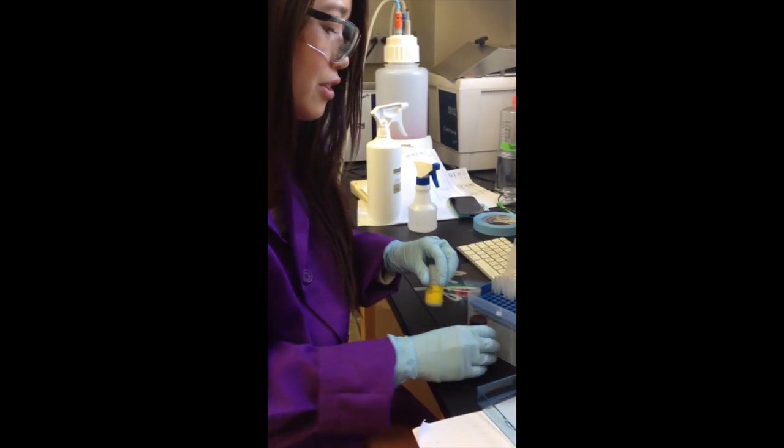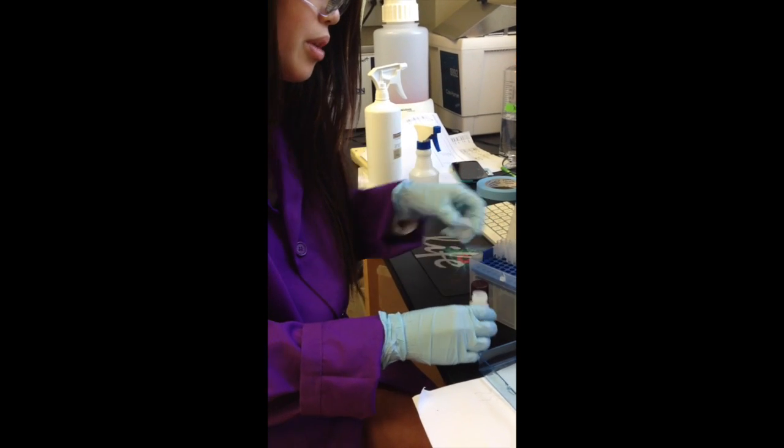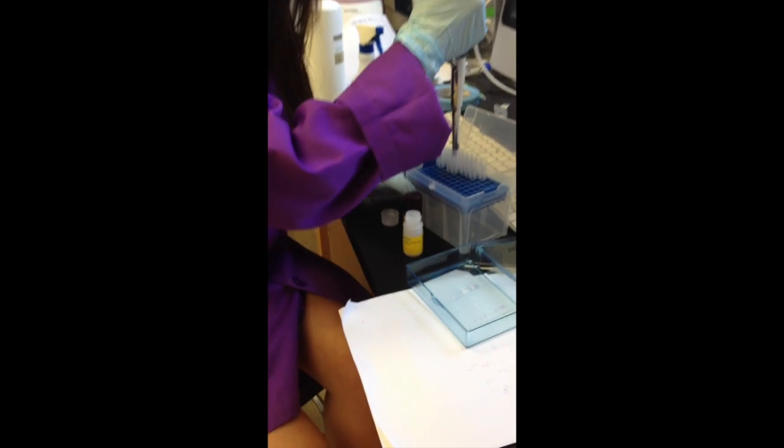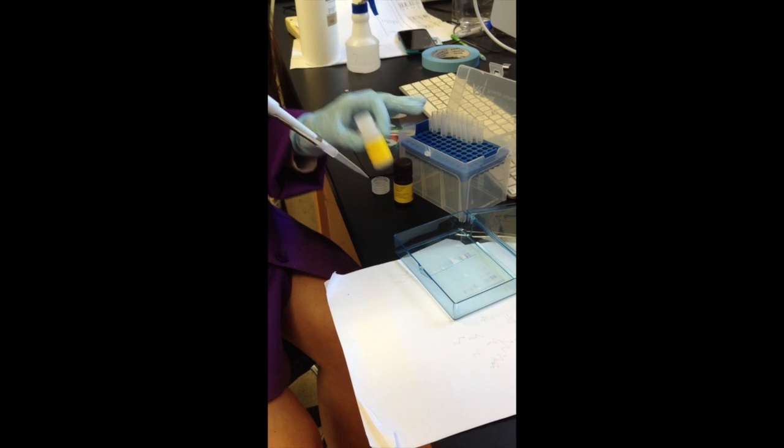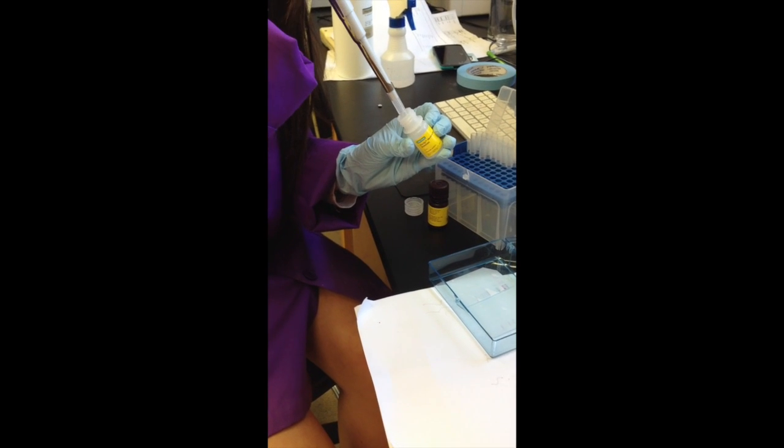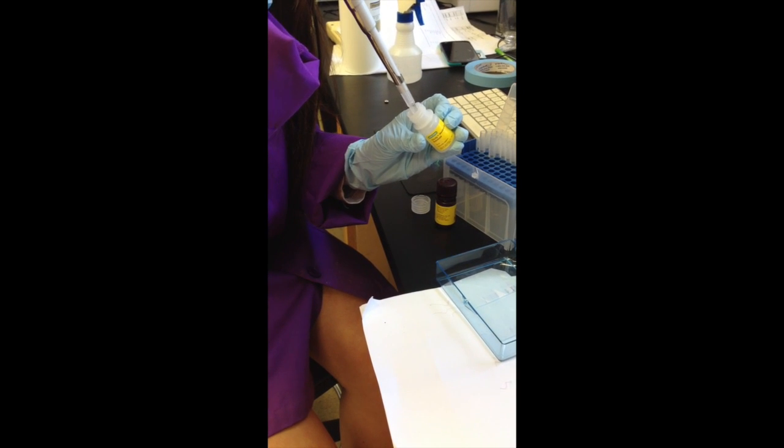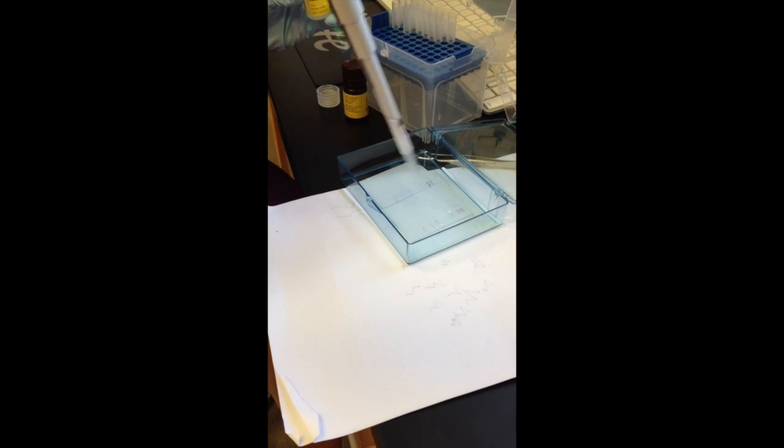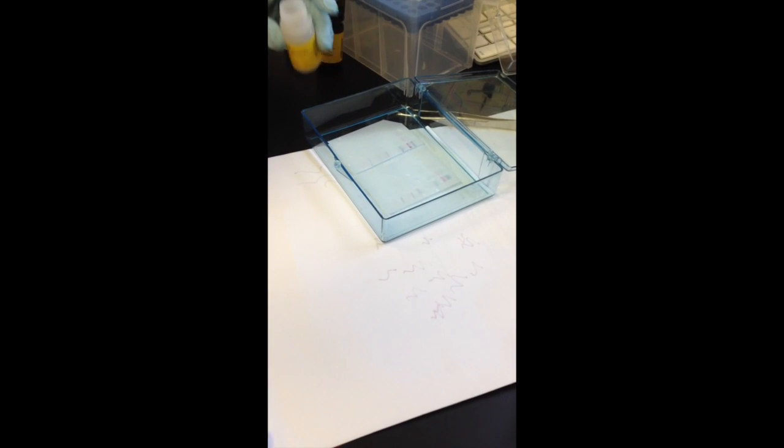We're going to use one milliliter of each and pipette that in. Pipette it directly onto the Western blot.